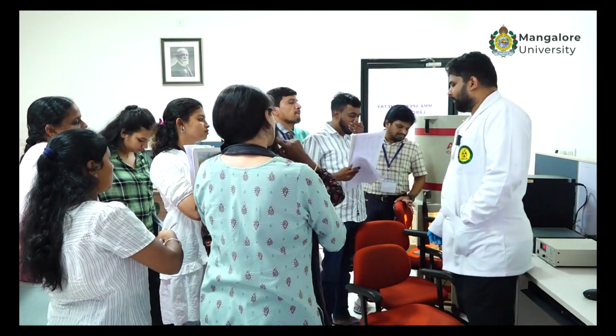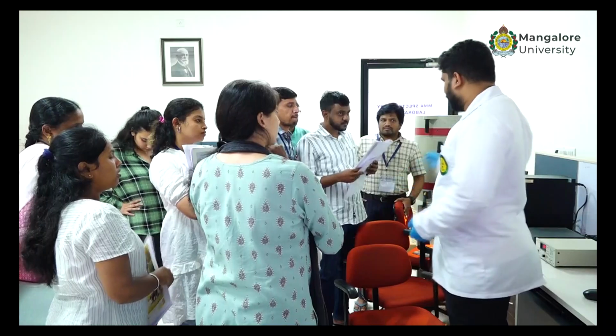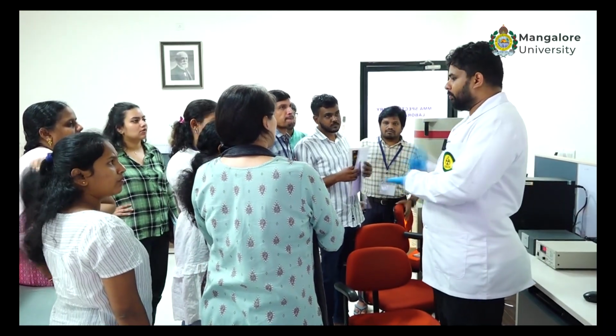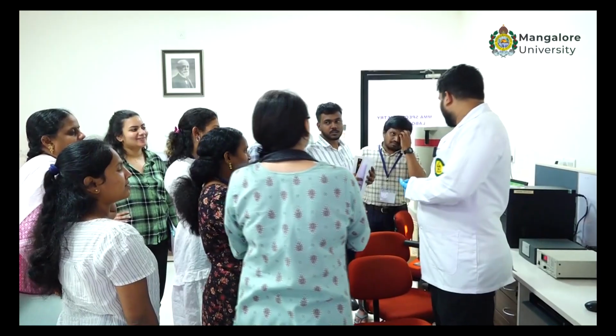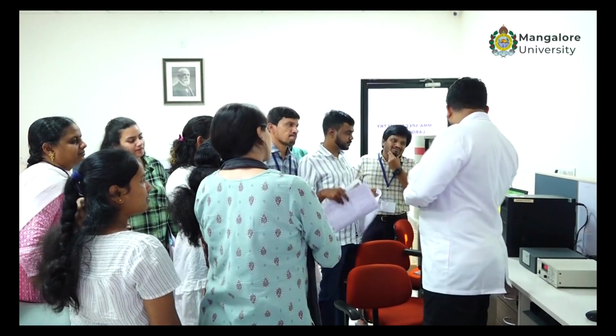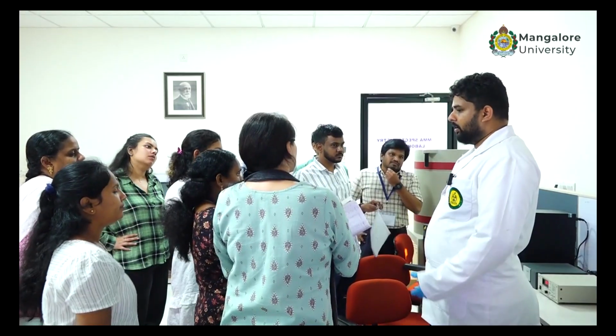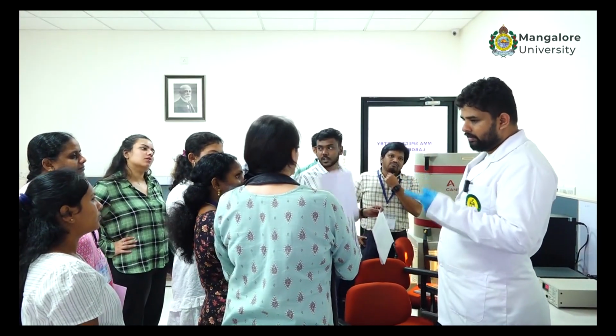Does it matter? No. Okay, so we will start with the experiment. For this batch, do you want a water sample or a swipe sample? Water sample. Okay. If you want a water sample, we will do it in this lab, on this PC, and swipe samples we can do on that PC.